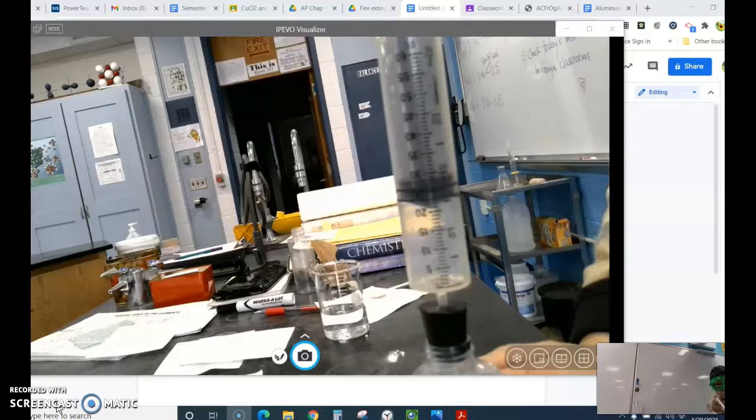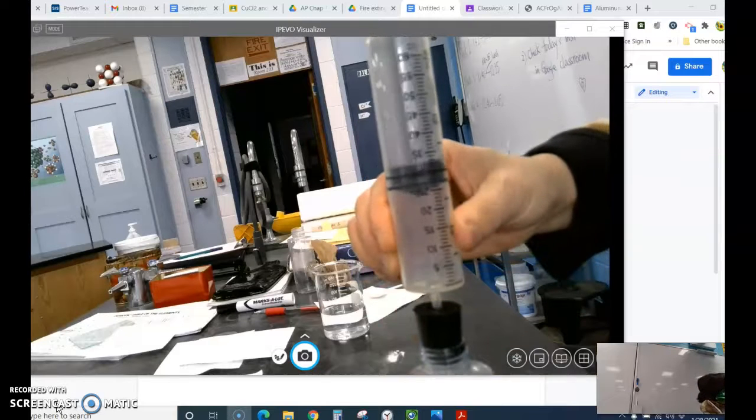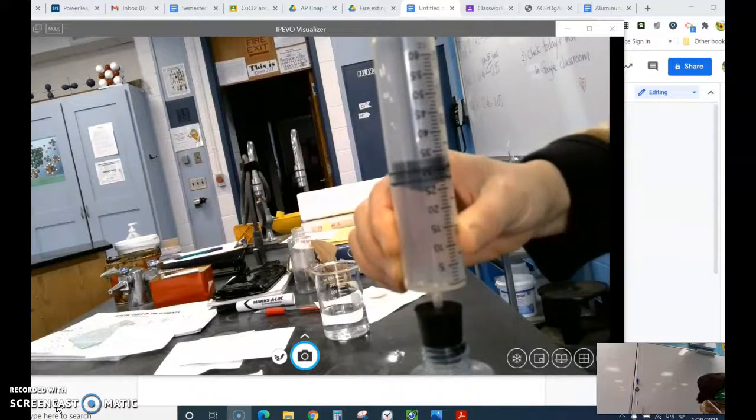When it's close to stopping, I will show you closer. Okay, it's close to stopping. Let's wait 1 more minute to see. Okay, I think it has kind of stopped.